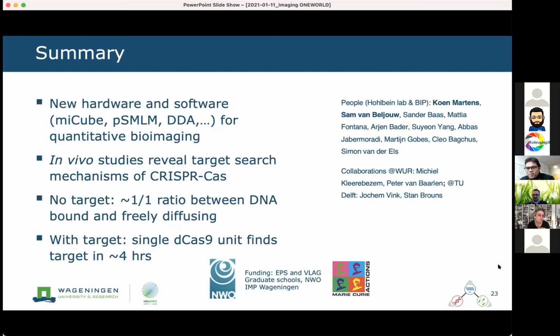Yeah, the whole discussion we have with light sheet in particular, and also super resolution, started this wave of people making their own systems. With digital electronics and 3D printing, it has become, as you have described beautifully, really easy and quite feasible to make microscopes in the way we think is most useful for our research.